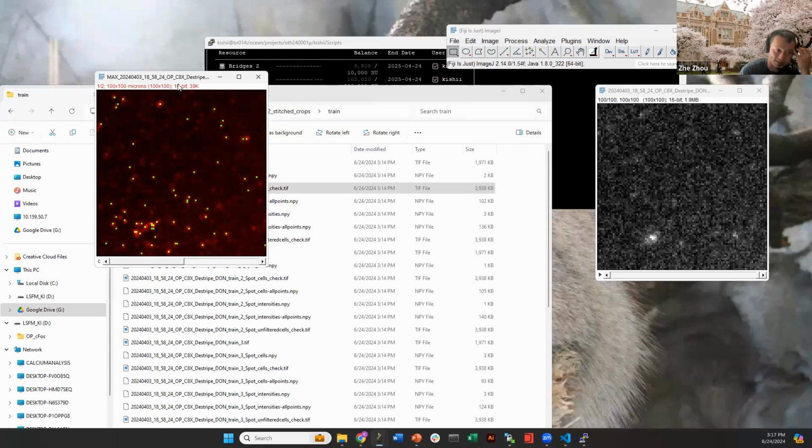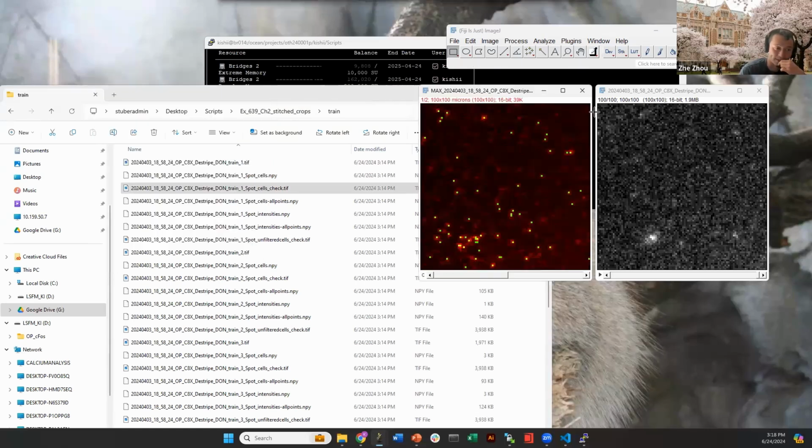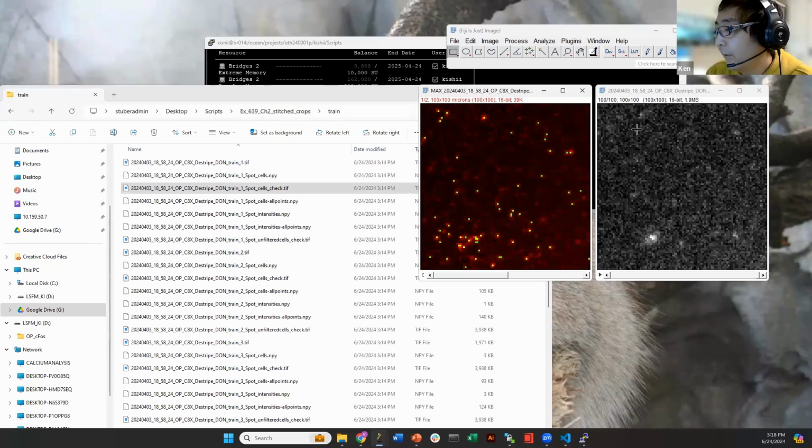Okay. Do the threshold parameters in the variables file alter these results a lot? Yes, so the two main files that you want to go through are the variable file that stores the parameters for the cell detection, but also the thresholding parameters, because some of these cells might not be picked up because the thresholding was too strong, or there could be some noise that is getting picked up because the thresholding is not enough. So yes, the main parameters that you want to adjust will be those two.